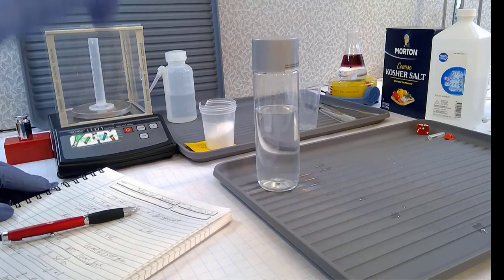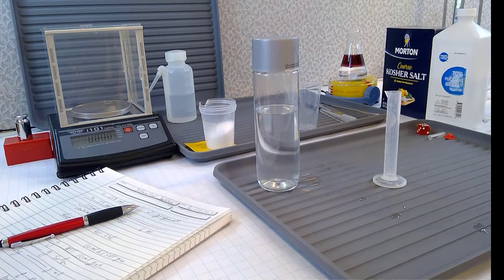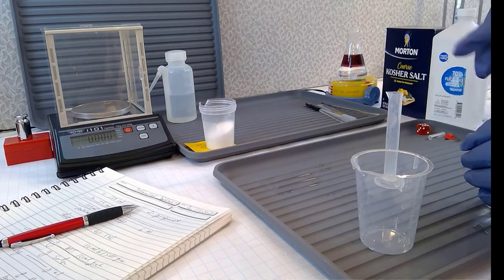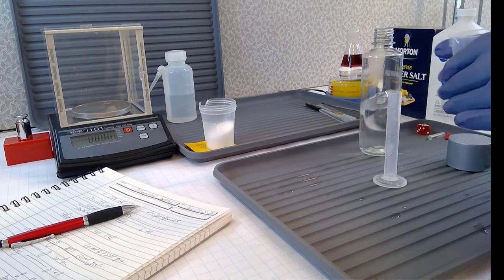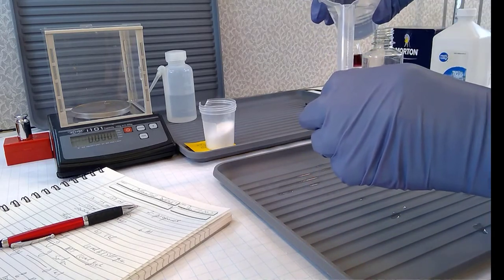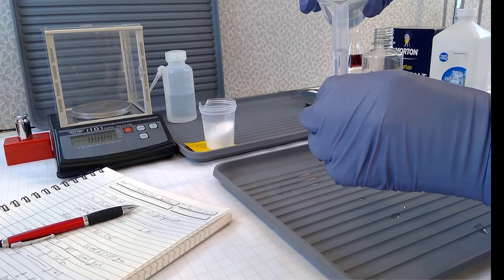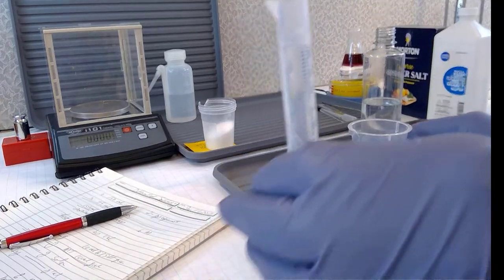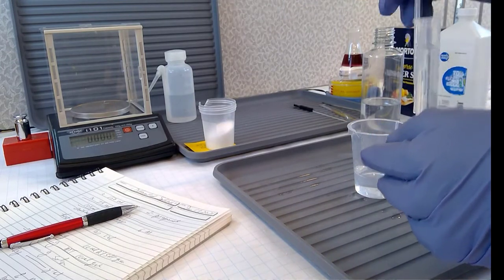That's beautiful. Now let's put 10 mLs of our solution in there. I'll pour it back into my beaker, and get the 10 mLs in. Here we go, 10 mLs, a little stream. It's got a nice little spout. Be a little more careful here at the end. It's a little bit too much. As you can see, I'm way above that 10 ml mark. So my good old pipette bulb.